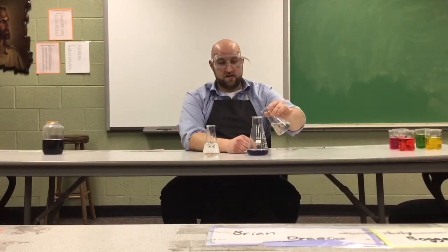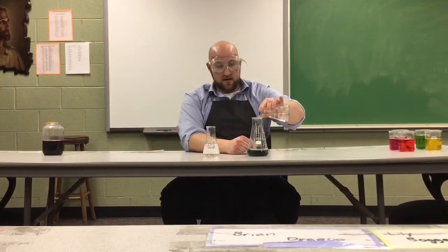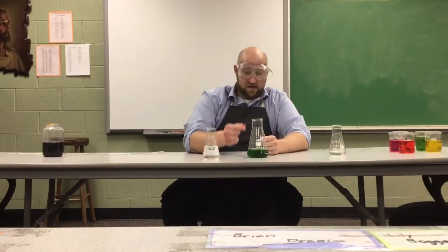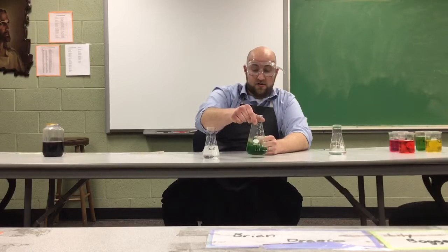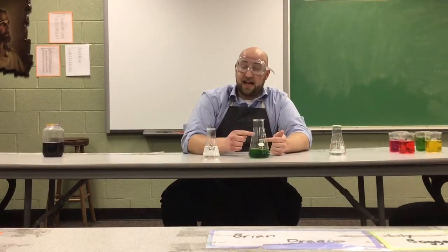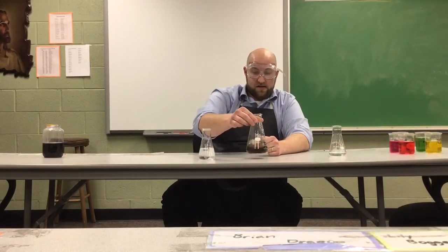We're going to mix them together into a separate container and perform this neutralization reaction. What we're looking for is a neutral color out of our red cabbage juice — that will tell us when we've exactly achieved the right combination of acids and bases. Here's our neutral color. Let's pour in quite a bit of this sodium hydroxide. We can see that this is a strong base — it's giving us this greenish color, and if we swirl it around more it'll start to transition towards that yellowish-green color. If I want to make a neutral, I can add exactly the right amount of acid.